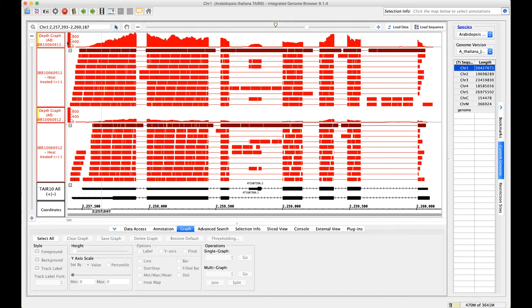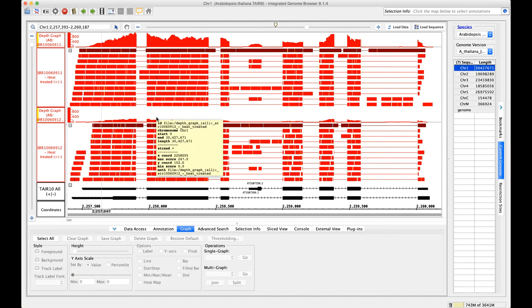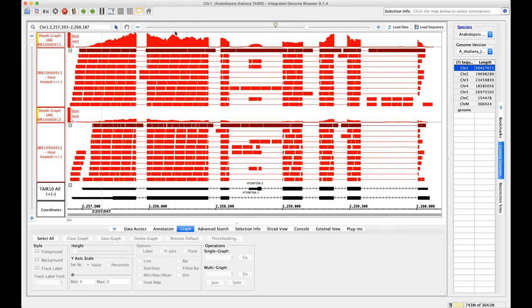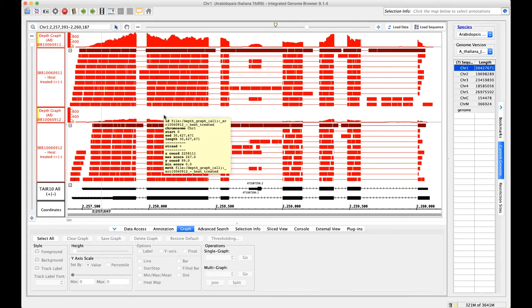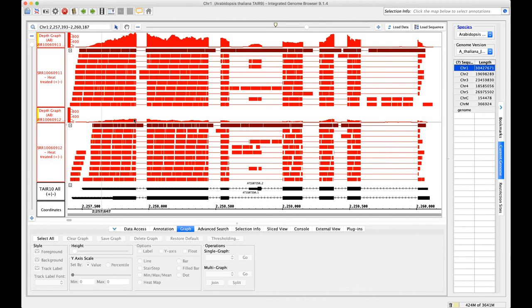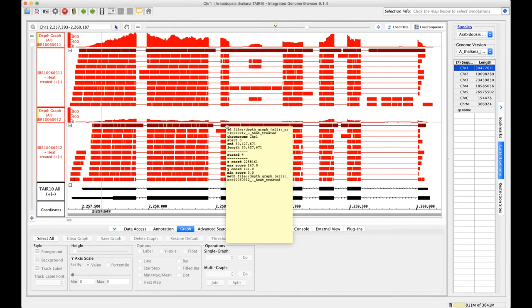Here we've got up to almost 800 to 1,000 reads in some locations, or a depth of, whereas here we have fewer, maybe 100 to 200. We know we've got a smaller file size, so maybe there's just fewer reads. And if I had to guess, that's why. It's not that we're seeing a difference in expression between these two samples. We would expect, because they're both under the same experimental conditions, that they would have a very similar expression. My guess is that the reason we're seeing this decreased amount here is just because the entire file itself is much smaller for some reason.